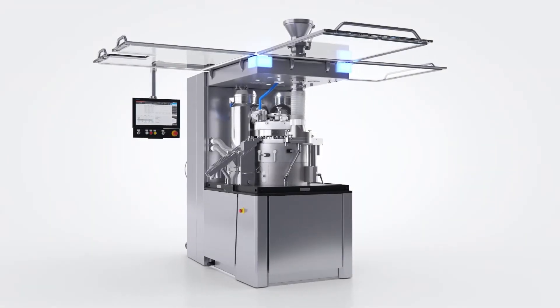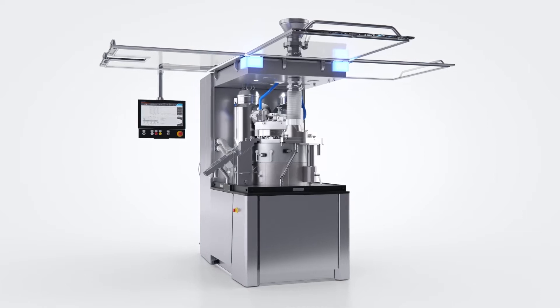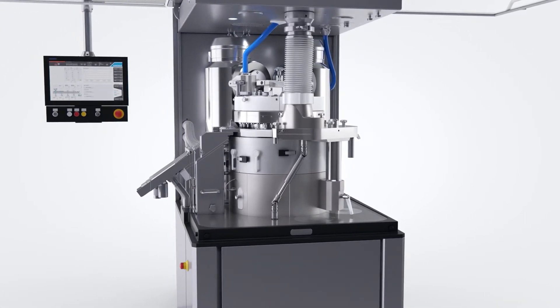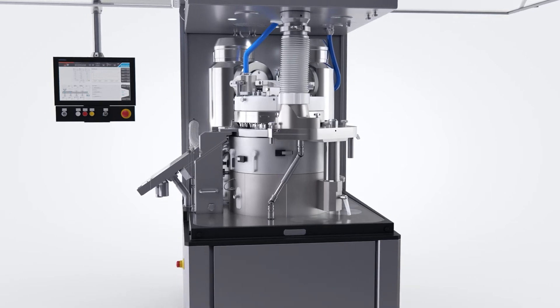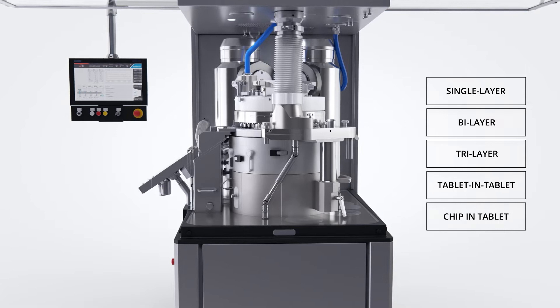The Korsh XL404 MFP is a flexible and modular high-speed single-sided tablet press that features the capability to produce tablets of any size, shape, or format including single layer, bilayer, tri-layer, tablet-in-tablet, and chip-in-tablet.